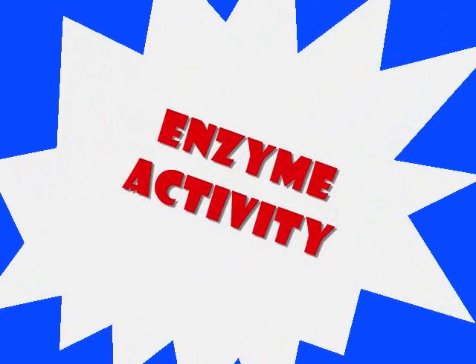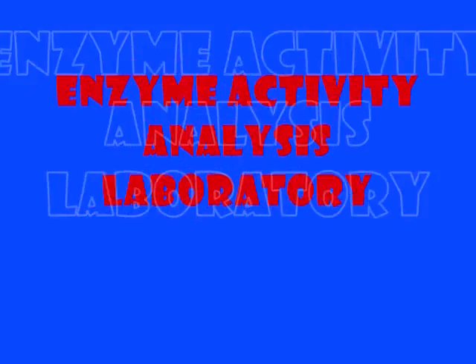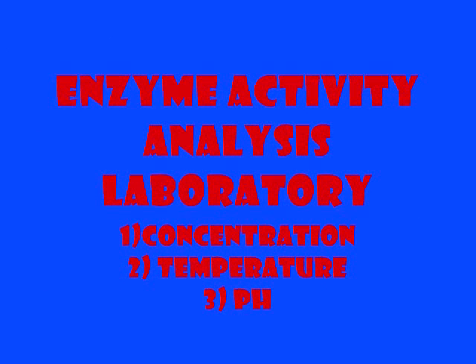Enzyme Activity, brought to you by Dominique, James, Henaro, and Taylor. This video presentation focuses on a laboratory that analyzes enzyme activity. The analysis was done to observe the effects of 3 experimental variables on enzyme activity: concentration, temperature, and pH.